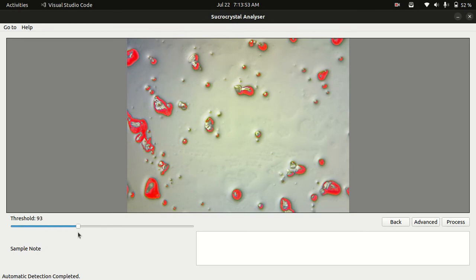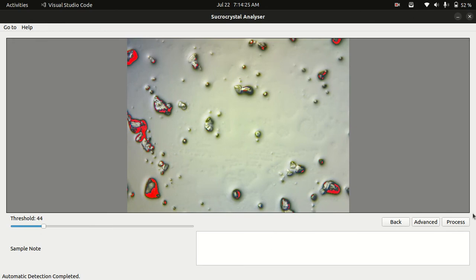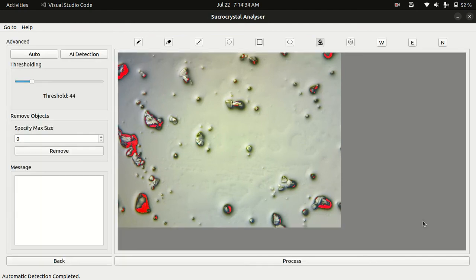The detection is important to identify shapes and sizes of the crystals. If you are satisfied with the detections, you can click on the process button to start generating the report. Otherwise you can click on advance for further changes.